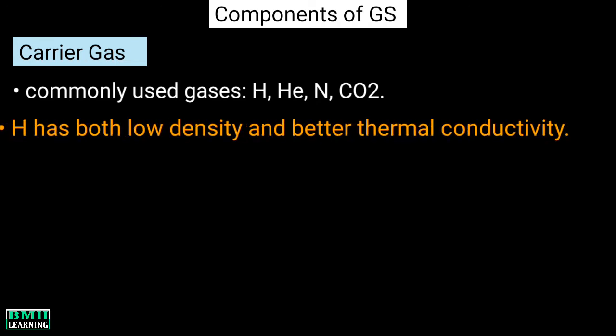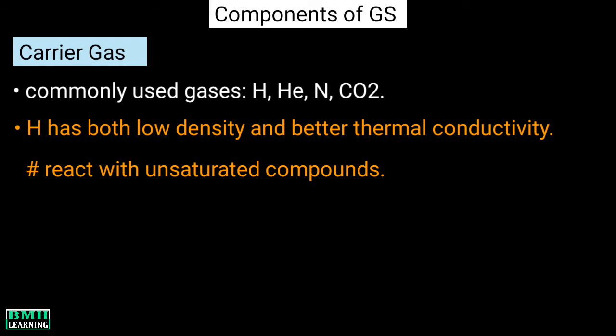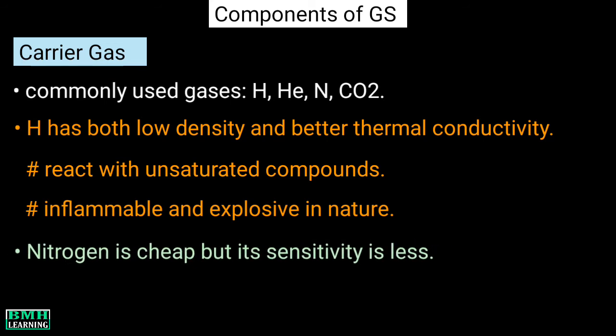Now, hydrogen has both low density and better thermal conductivity, but it can react with unsaturated compounds. Also, hydrogen is inflammable and has explosive nature. Talking about nitrogen, it's cheap but its sensitivity is less. So that's why helium gas is preferred.